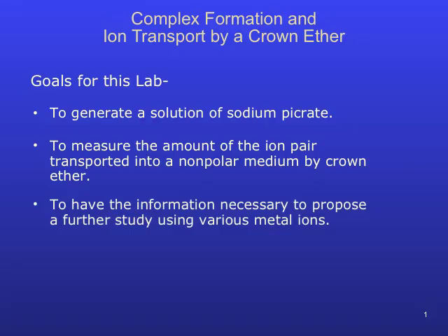For the second week of this experiment, you will submit to your TA an experimental procedure for comparing the extraction of each of the alkali metals using the same methylene chloride solution of crown ether. Your final report will include the standard lab notebook requirements, experimental data, and discussion of your experimentally measured results.